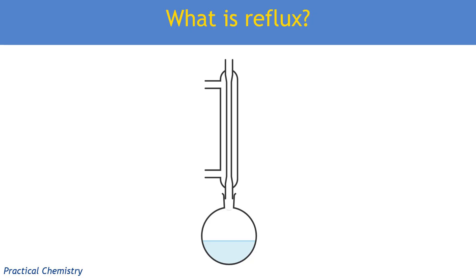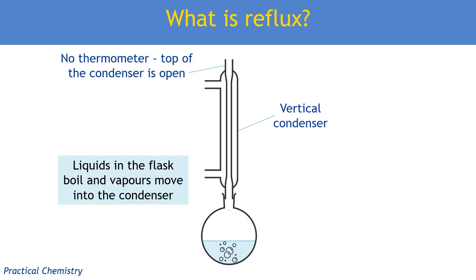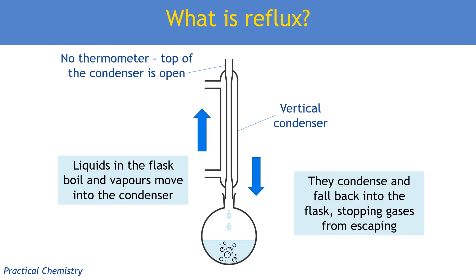Now let's move on to reflux or as it should probably be called heating under reflux. And this comes up in almost every organic reaction. So it's very similar. It includes a round bottom flask. It includes a condenser. But this time the condenser is vertical, connected directly to the top of the flask. Really important, very common mistake. Notice that there's no thermometer and the condenser is completely open at the top. That's so when we heat the mixture, any liquids that boil are going to travel up into the condenser. And then when they get there, because of the cold water around the condenser, they're going to condense and they're going to fall back into the flask. And so this stops any gases from escaping.